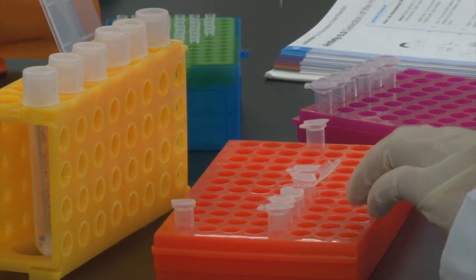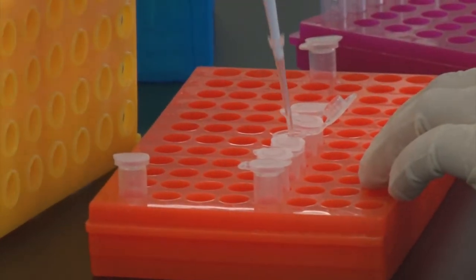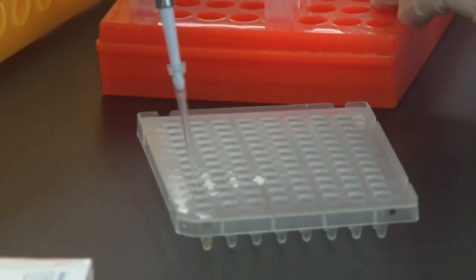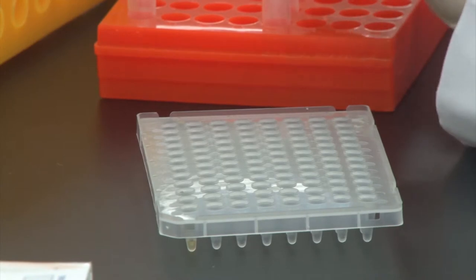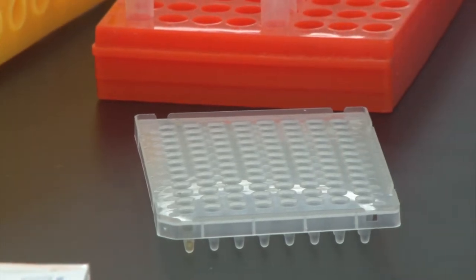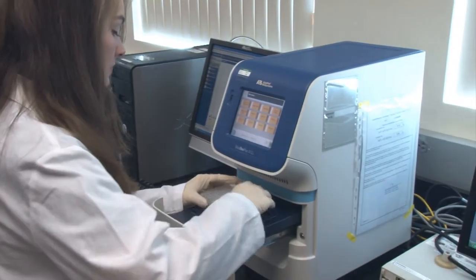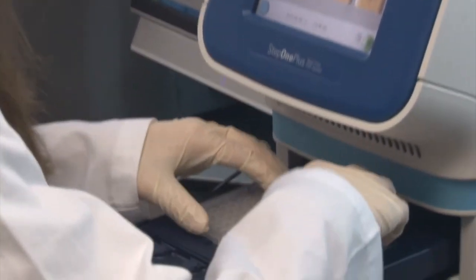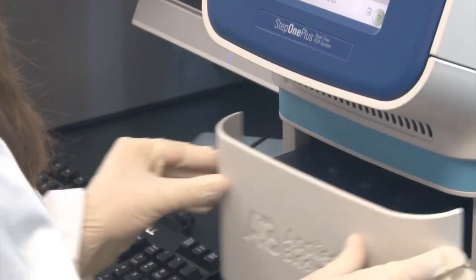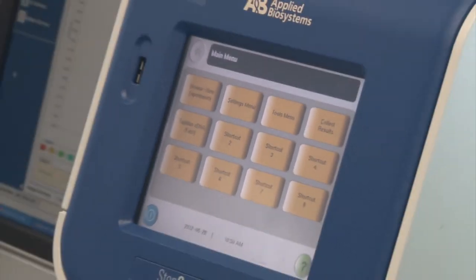Add 20 microliters of master mix to the PCR tubes. Master mix contains dNTPs, DNA polymerase, magnesium chloride, primers, and buffer. Put the PCR tubes in the PCR machine and set up the PCR reaction times.